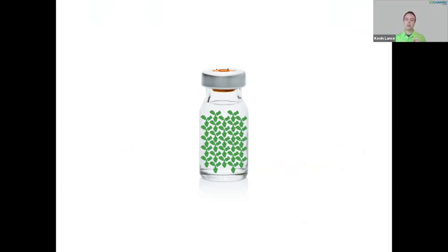Now, the problem with high concentration biologics is that when you increase the concentration, you increase the viscosity. And measuring that's critical to know how your drug is going to perform. If you're injecting this drug, then the ability to inject it, or the injectability, and the syringeability, the ability to get it out of a vial, are two crucial parameters that you need to know.